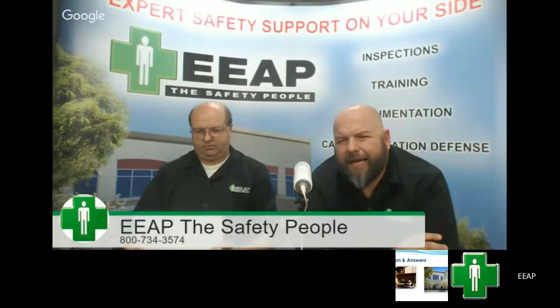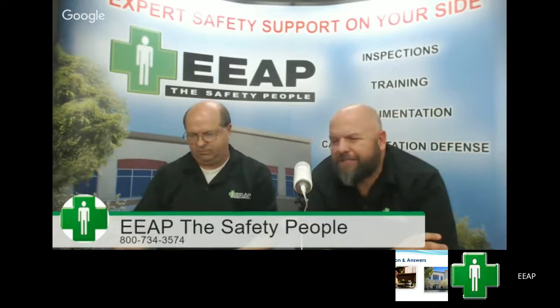All right, we have somebody asking if there are non-plumbed showers. There are non-plumbed showers, I believe, but here's your problem with your showers. You'll notice that we did not have a length of flow, like 15 minutes for the eyewash station. We didn't say that for the shower because there is none. So I'm not sure how a non-plumbed shower would look. I'm sure somebody's got one, but I've never seen one, and so I would think you should go plumbed on that one. That would be a lot of water to have.